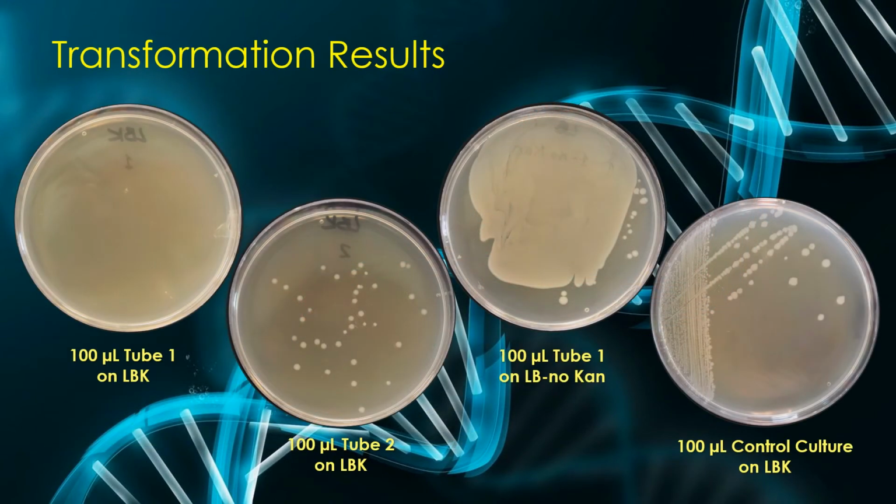Here are the results. I'm not going to explain what's in each of these tubes anymore. I think I've done that at least a couple of times already, but there are the results. You can see in plate number 1, there are no colonies. Plate number 2, there's a bunch. Plate number 3, there's growth all over the plate. And plate number 4, there is growth on the plate. So take a look at table 9-1, fill that out, and you'll have to answer the questions for the lab report.